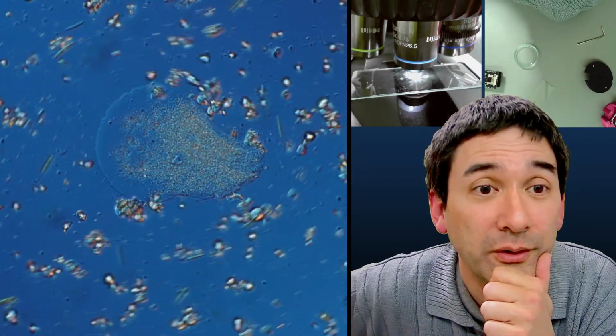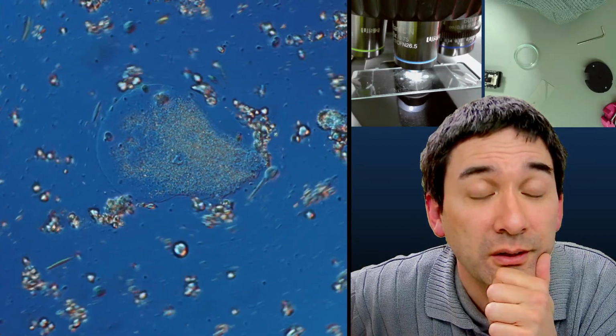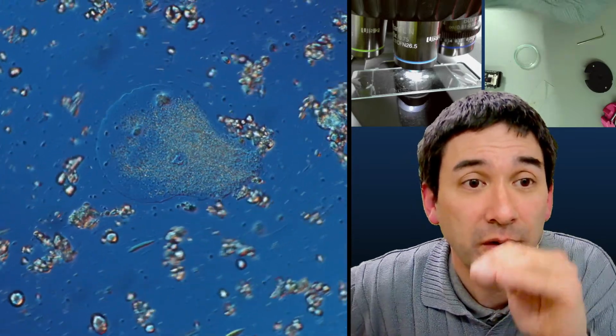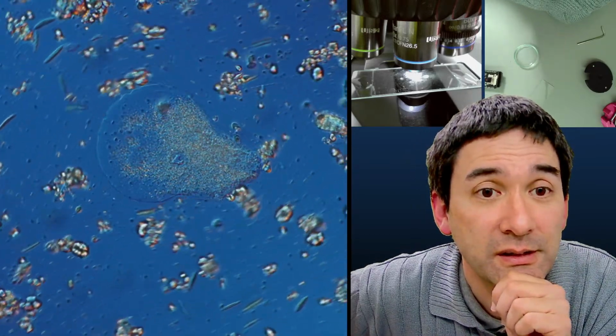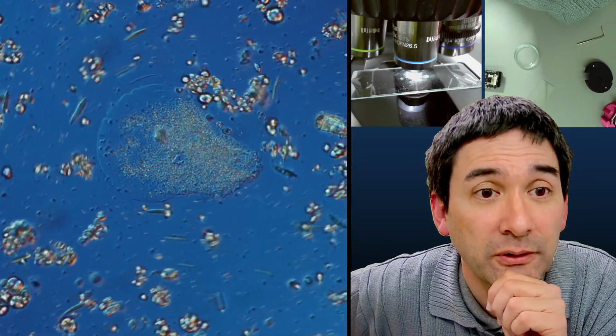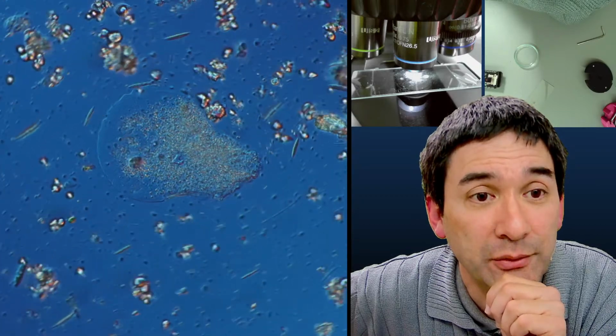I wonder. As more and more water is drawn in, the cover glass should rise. And let's have a look if we're able to regenerate the shape, but I kind of have my doubts.